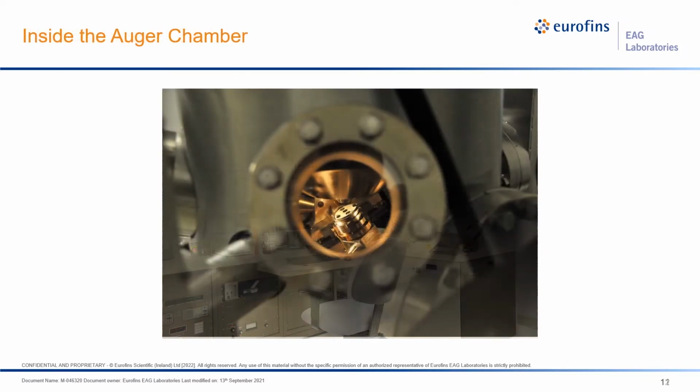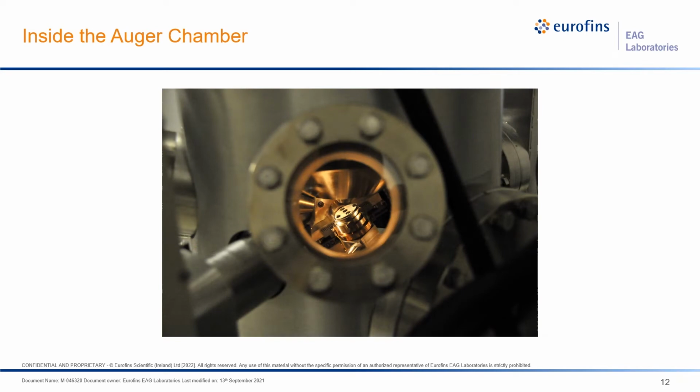Here's a look through our viewport, and we can see the sample on our stage. In this system, we are limited to a 1-inch diameter sample holder, but we do have other systems capable of much larger samples.